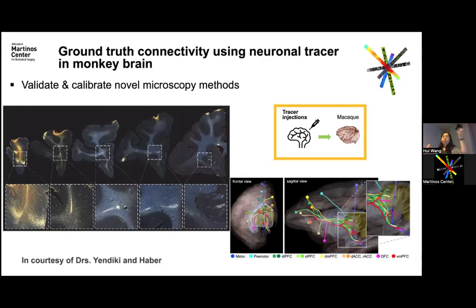Then they do diffusion MRI and take slices of those tracers and image where the tracer goes from slice to slice, so that they can establish these connections of fiber tracks across multiple sections. They only look at where the tracers go across those slides, find the corresponding locations, and establish these different tracks.